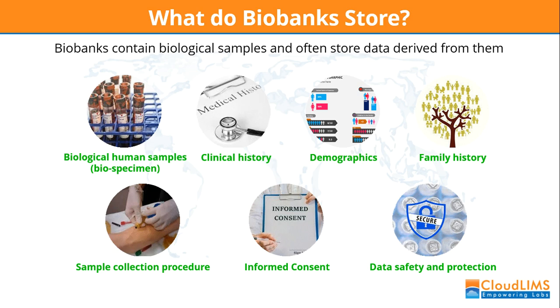So the biobanks will be responsible for managing the consent of patients in order to be able to share the tissue resources and the information in compliance with the regulations that are laid down by either the Human Tissue Authority in the United Kingdom or other authorities, for example, the FDA in the United States.